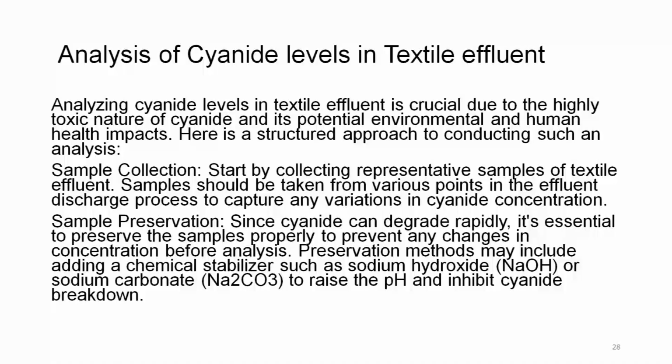Analysis of cyanide. Analysis of cyanide levels in textile effluent is crucial due to its highly toxic nature and its potential environmental and human health impacts. Here is a structured approach to conducting such an analysis.